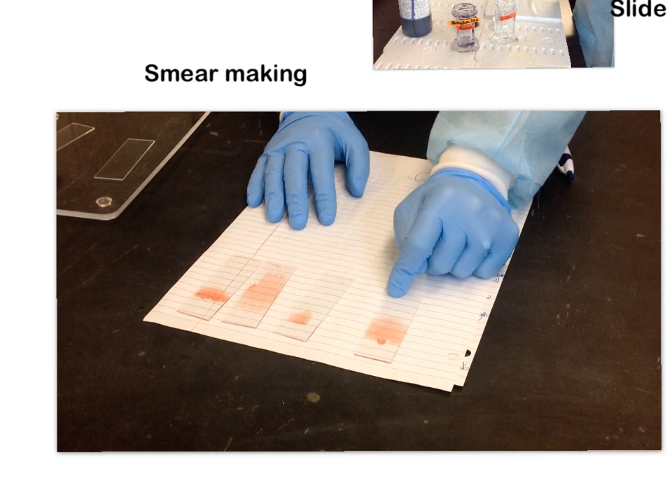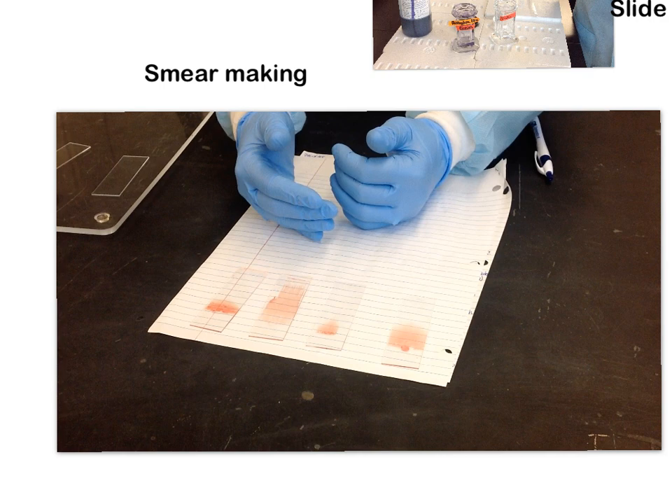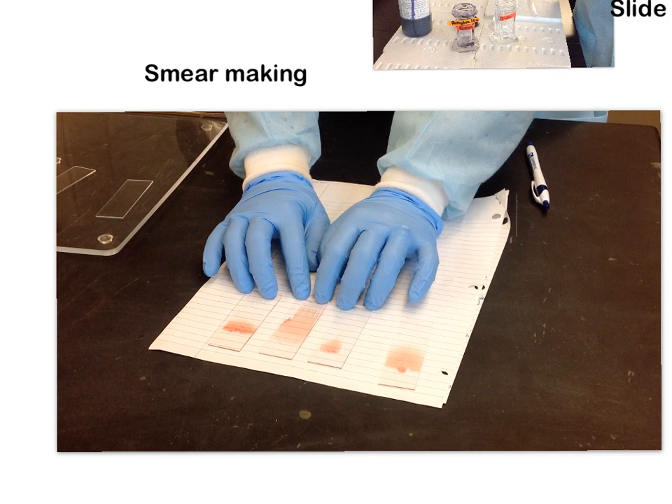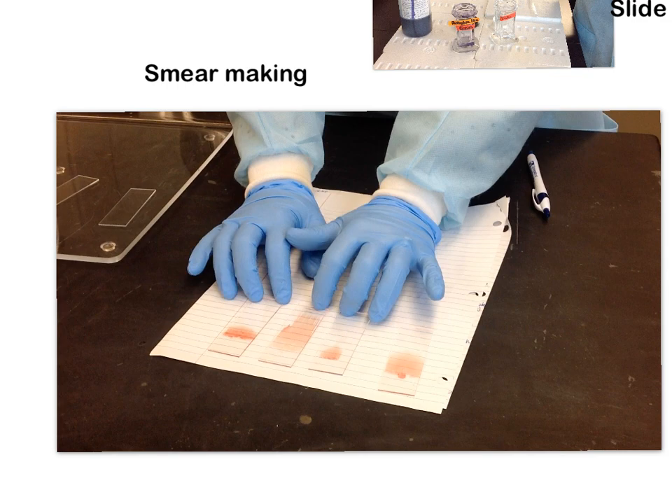When you make smears in lab today, I want you not only to try to make good ones, but also to purposely make bad ones — because it will help you figure out whether you went too fast or too slow, or used too much or too little pressure. I also want you to think about how those bad smears came about, because these are the kinds of questions I'll ask you on quiz one.